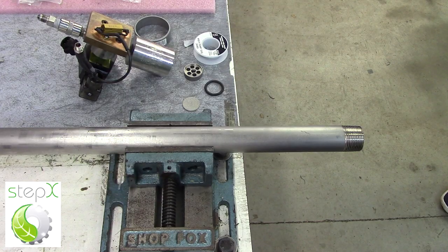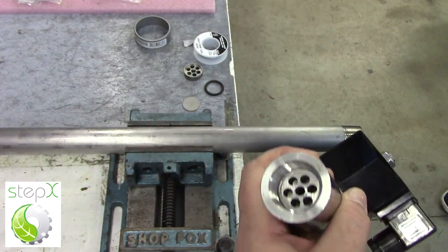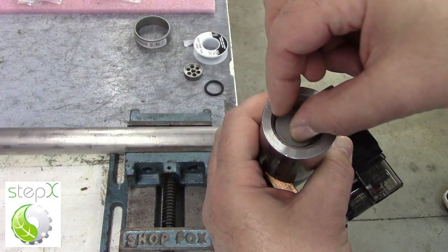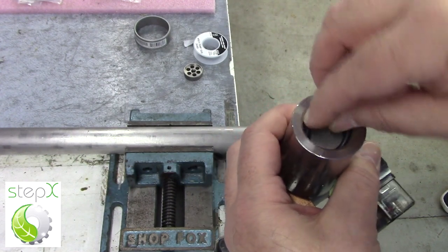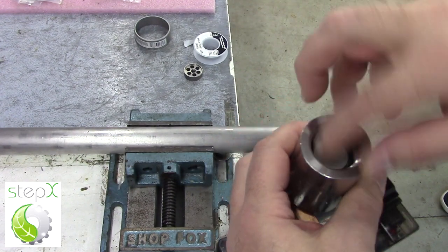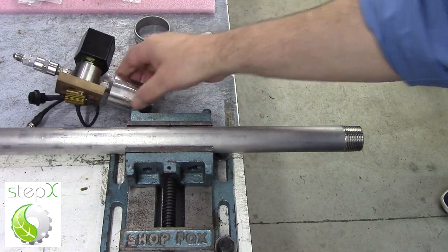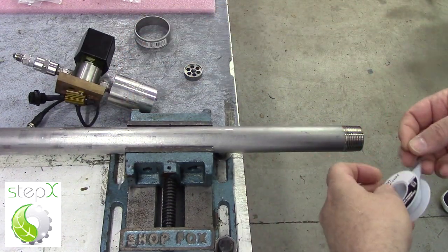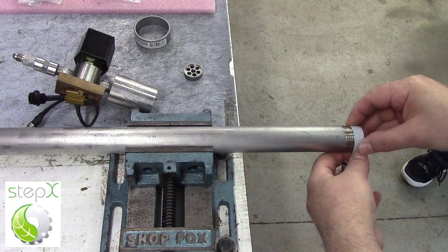Now that our reactor is filled with material, we want to put on our sublimation valve on the other end. We are going to put on the filter element, an O-ring, and screw on the sublimation valve very much the way we screwed on the other end. Again, we will be using Teflon tape to make a good lubricated connection — it also prevents galling.